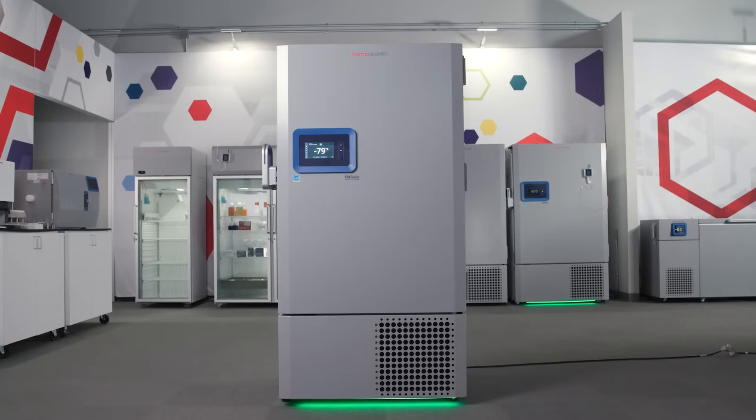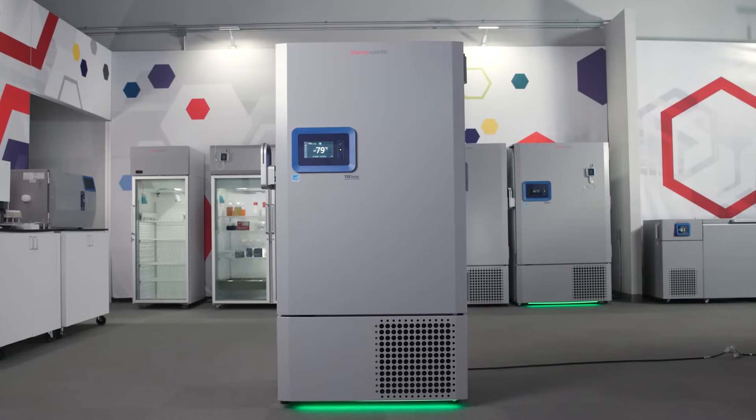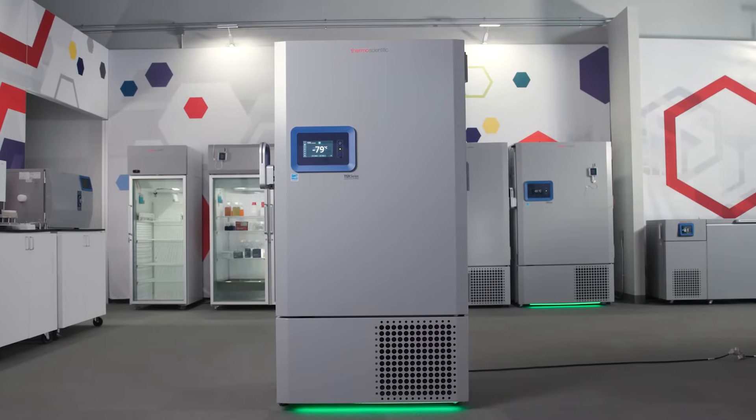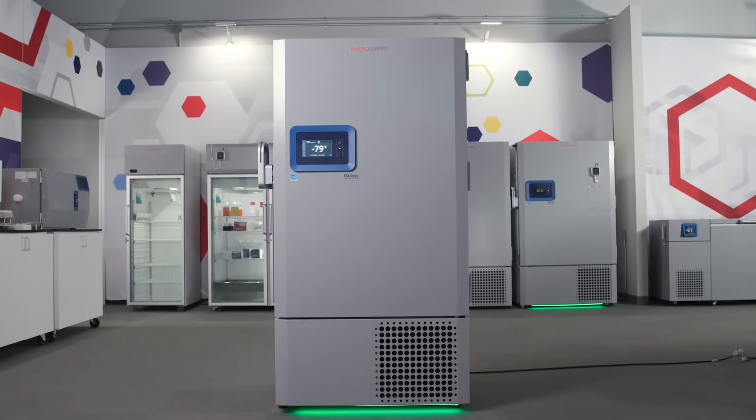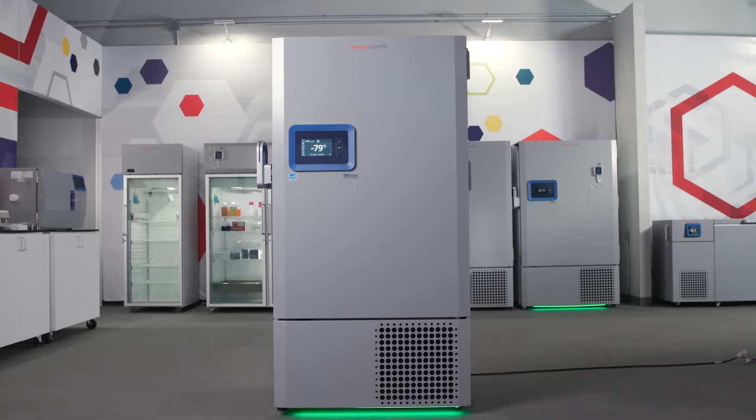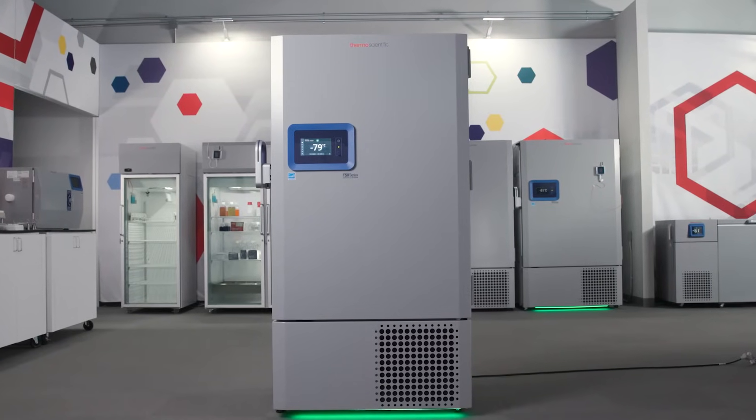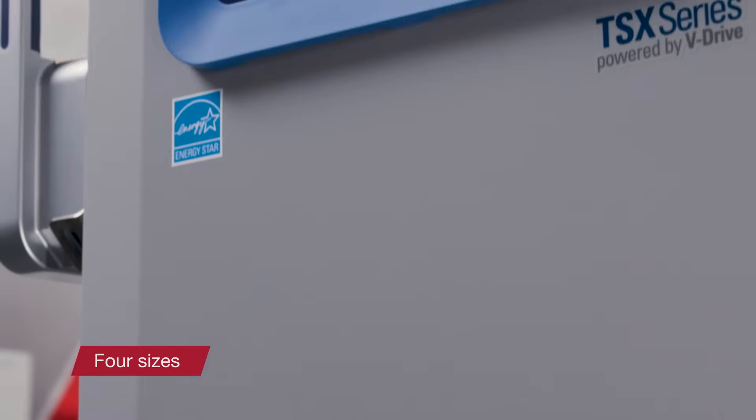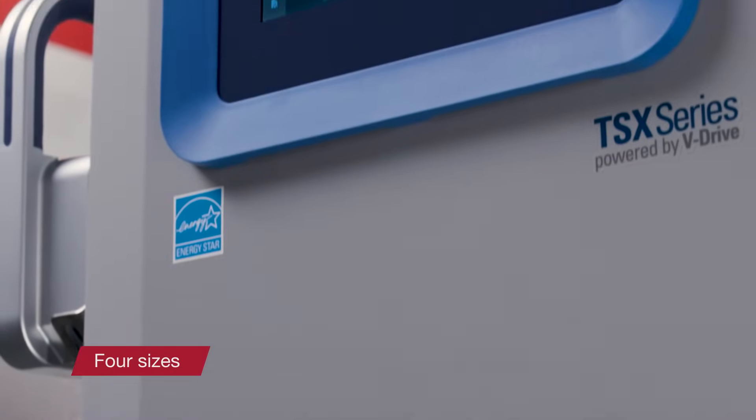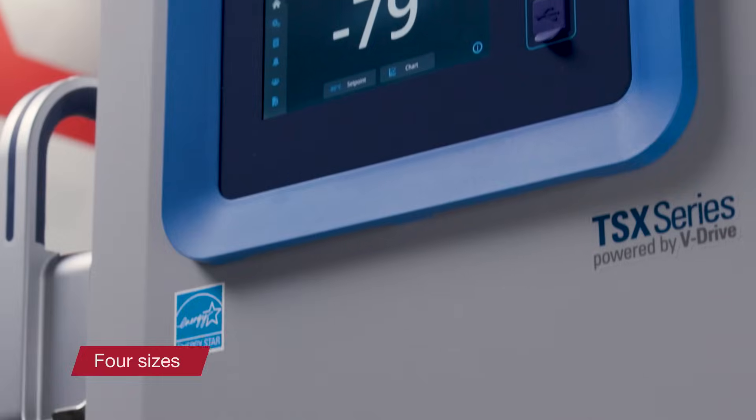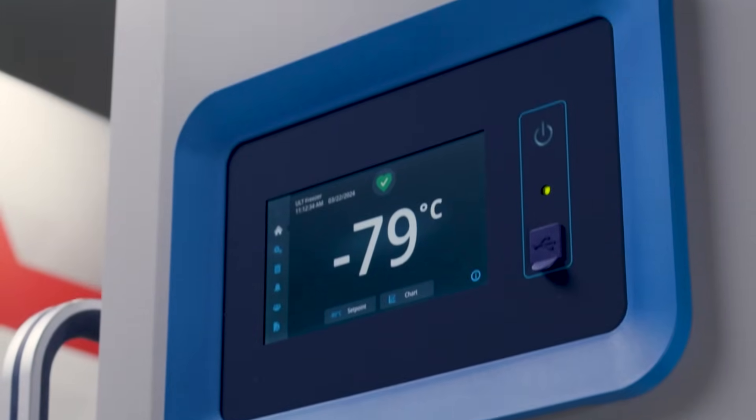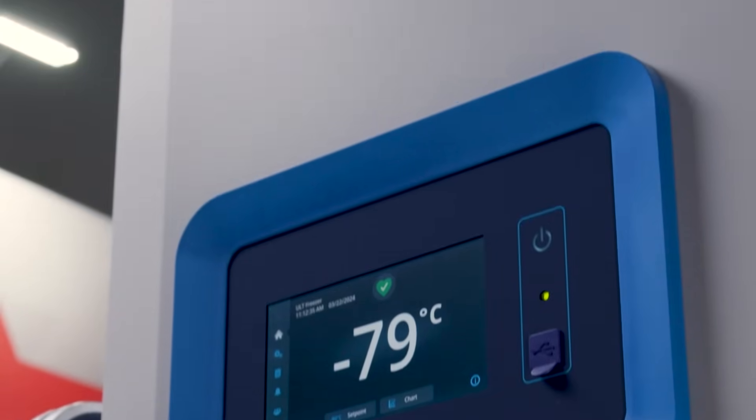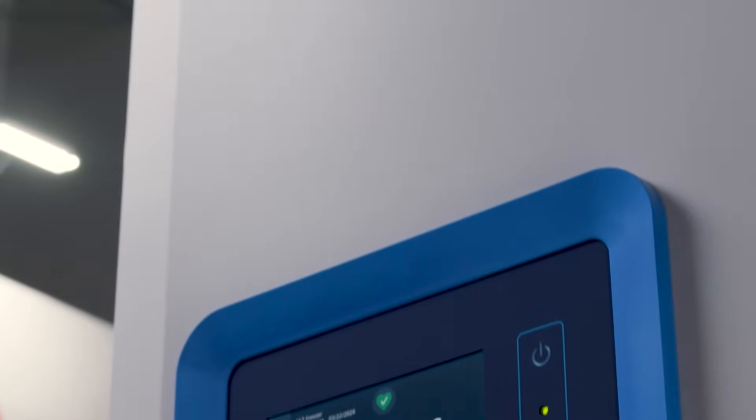the first thing to consider is whether the freezer can fit through all of the doorways. Not all freezers can. The TSX Universal ULT Freezer comes in four sizes, all of which can fit through doorways as wide as 34 and a half inches or 88 centimeters.